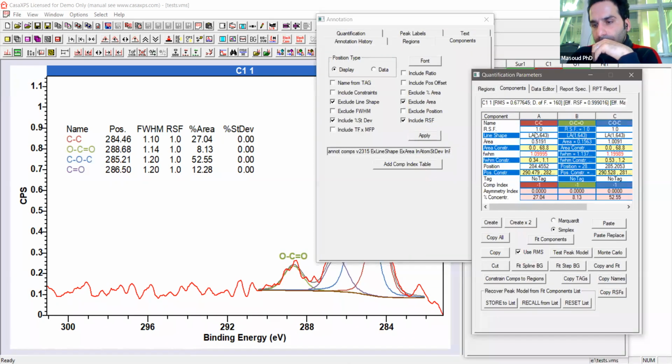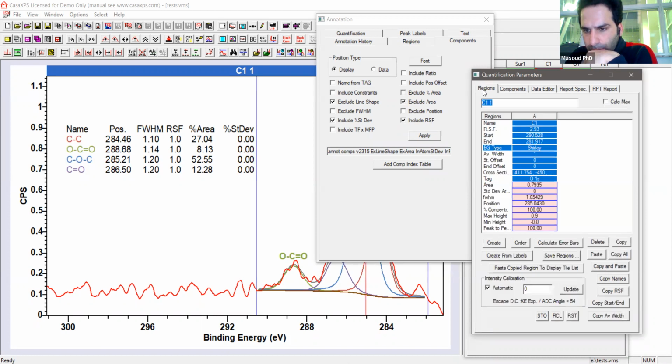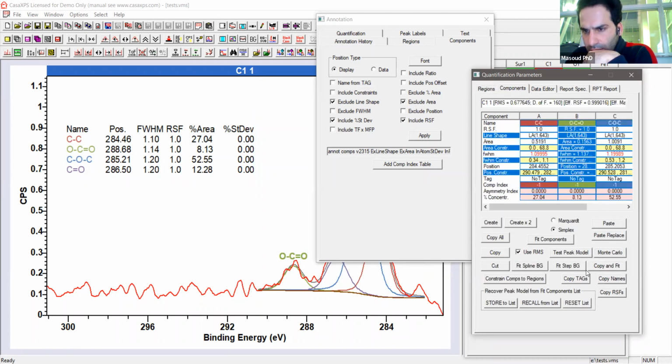because the reason why we are putting 0 here is that we didn't calculate the standard deviation. If you put in the standard deviation calculations, then you will have the standard deviation here as well.